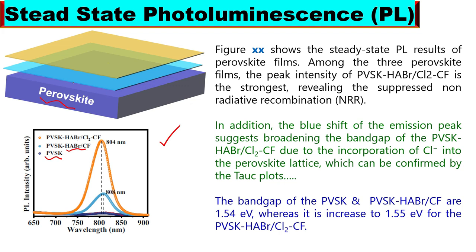That extra material I represent here. This one is that extra material. It may be in the form of a thin film, it may be in the form of doping, it may be in the form of solution, whatever the form is, but we just modified the perovskite surface and we want to see what changes we will get. So we can see that when we add this material to the perovskite, the peak shape changes and the peak increases in intensity. And in the third case, when we add this other material to the perovskite, which I represent here, there is a drastic change in the peak intensity.